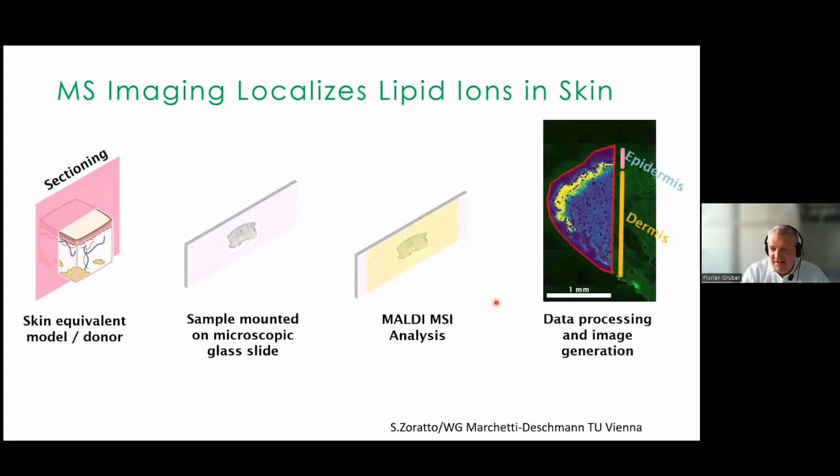In the end, you get an image that has the intensity data of each single molecule, as shown here. Yellow is a lot, blue is little. And of course, with one experimental run you can generate these distribution data, or relative intensity data, for thousands of molecules.